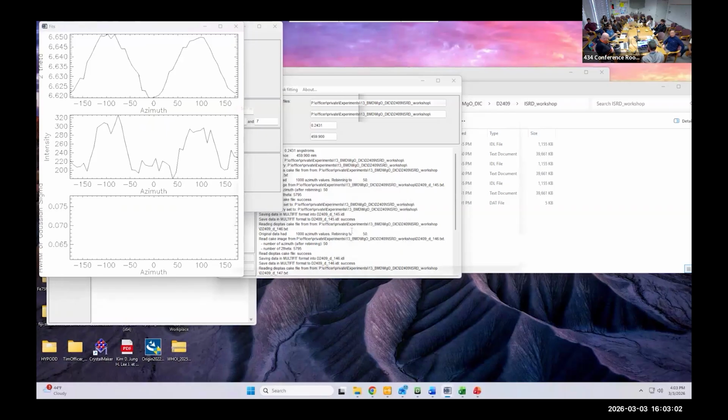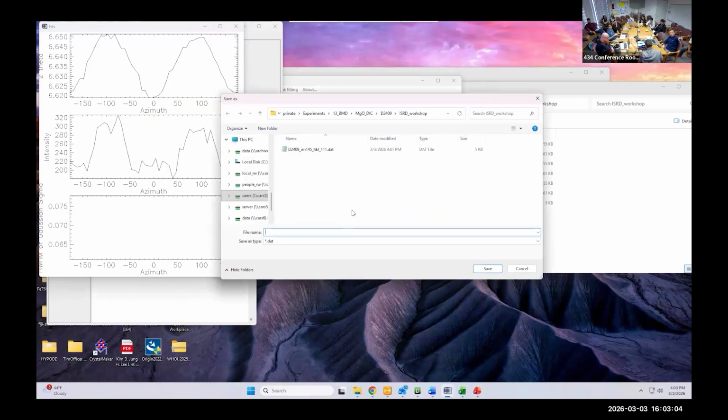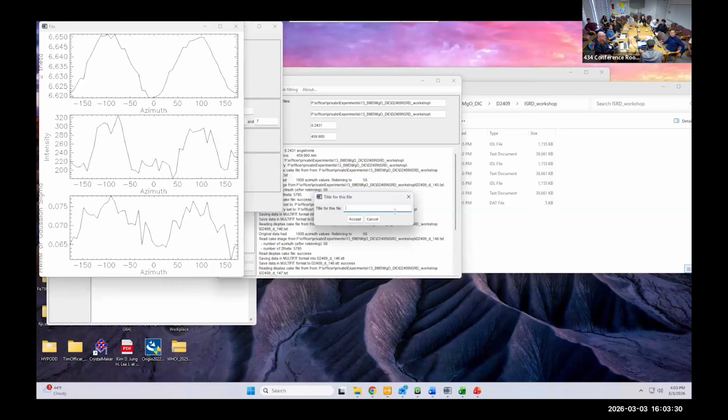So they've got 3 panels. The bottom one doesn't show anything. I don't know why. The very top one is the 2 theta variation. Second is the intensity variation. So later on, the intensity variation can be used for fitting the texture. I don't know. So Gaussian sigma? Gaussian, yeah. I don't know what that is. There it is. Now it showed up.